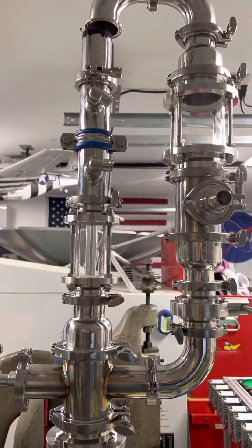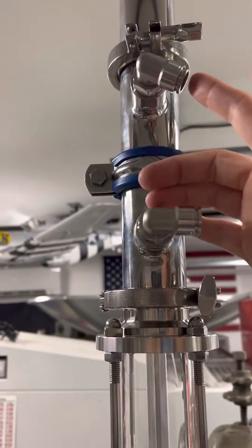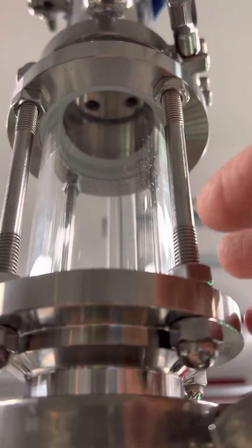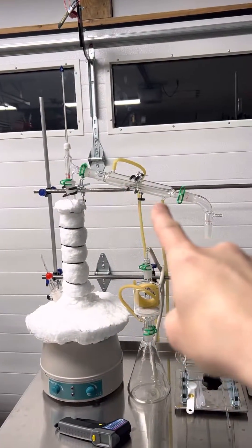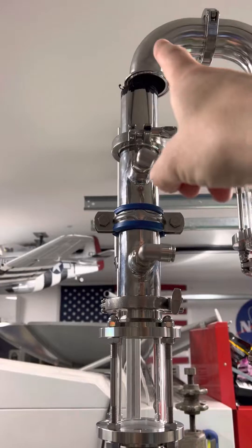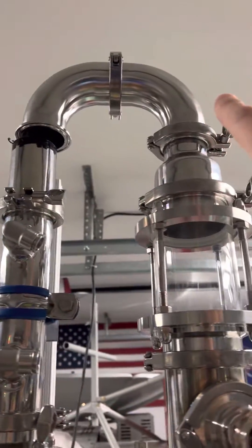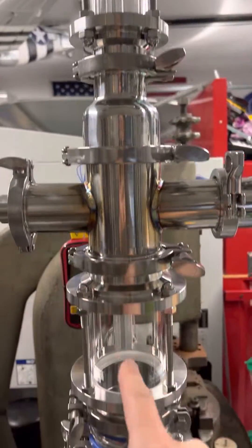Seeing how that stuff takes so long to make and how precious it is, I want to be able to collect it again. So the fumes will go up here — this is a condenser. Cold water is going in here and there are tubes up there, so it'll condense — just like cold water condensing it — and then it turns back into liquid. The electrolyte will condense back down, and any leftover will go over and then into here and just run back into the system.